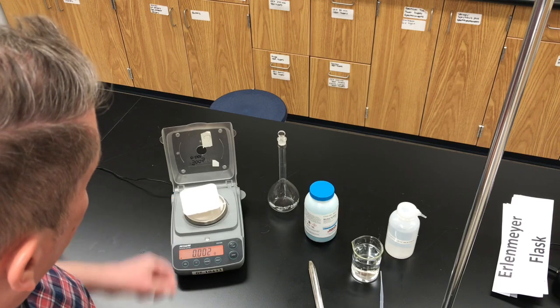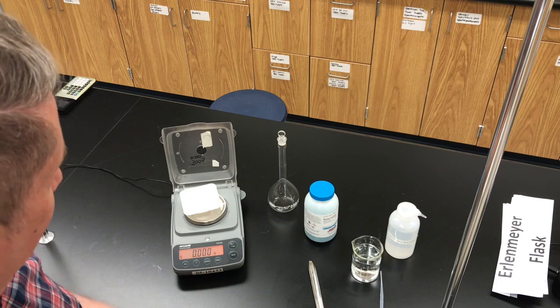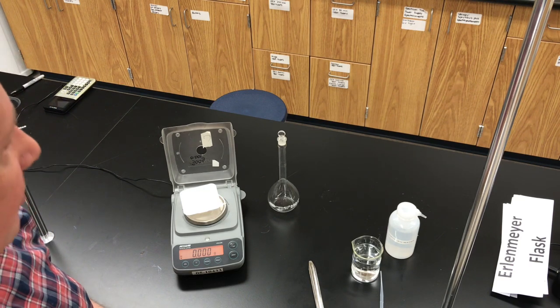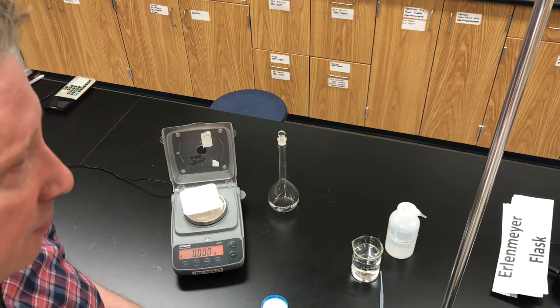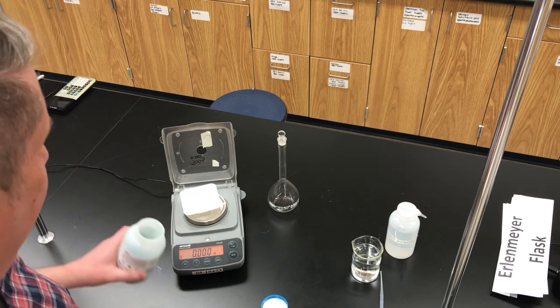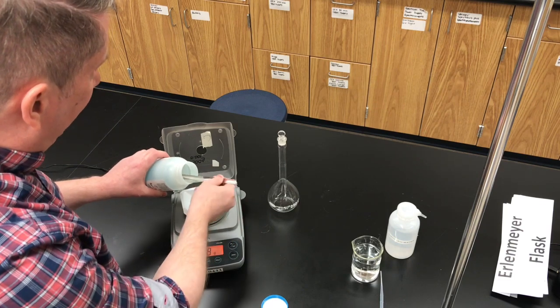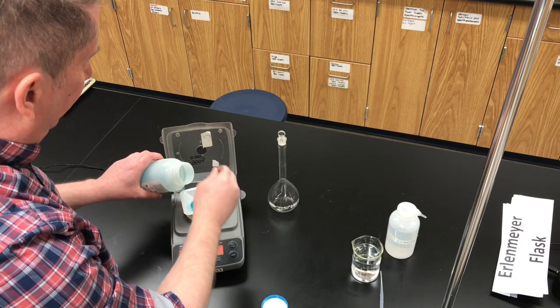I'm going to put the weighing boat on the balance and zero the balance so it ignores the mass of the weighing boat and shows zero. This is a milligram balance, so it goes to three decimal places. To prepare our solution with 0.200 molarity — that's three significant digits — we're going to use 13.1 grams. The two digits after the first decimal place I'm not really that interested in; we just have to be at 13.1 and anything very close to that.